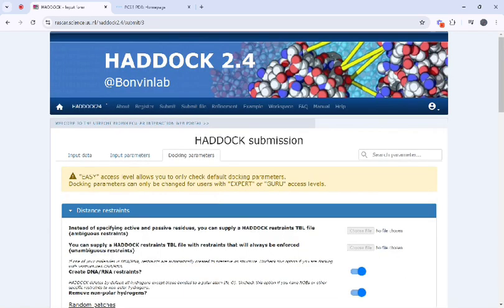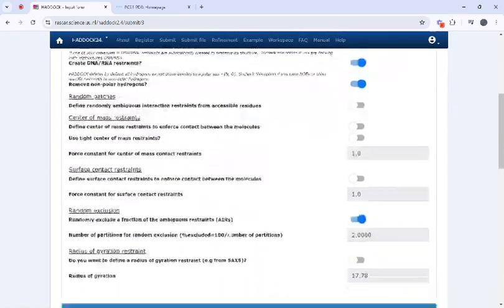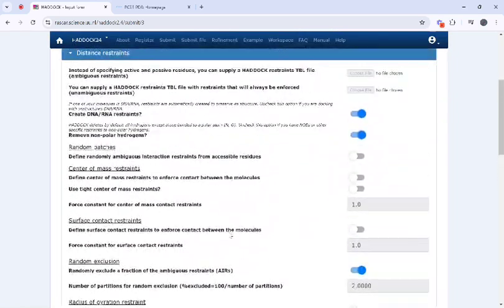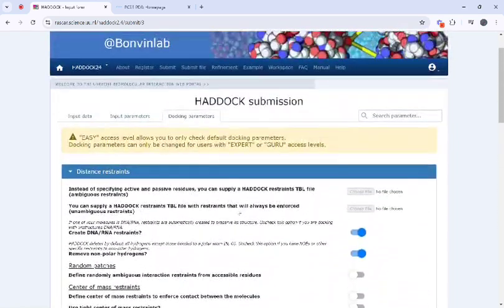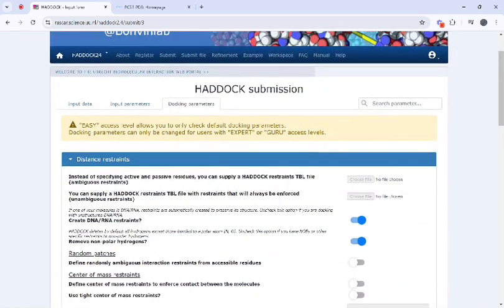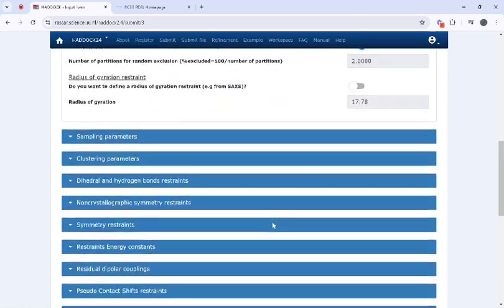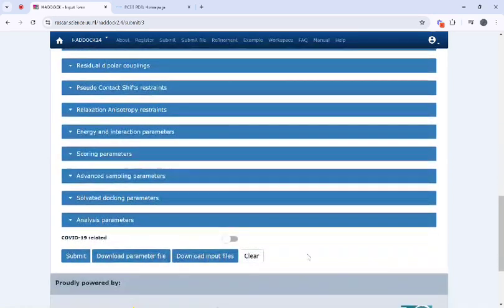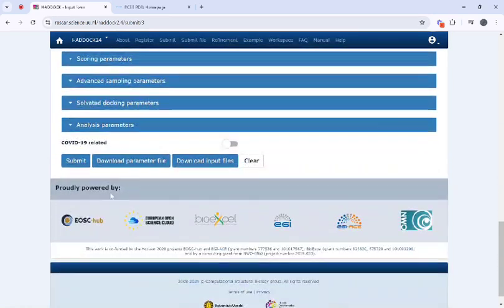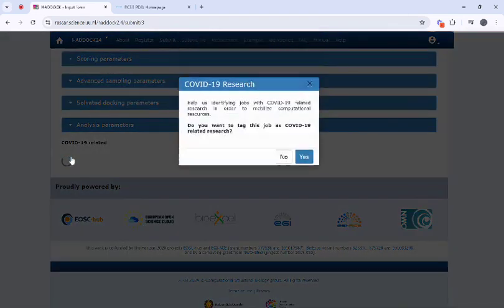Once everything is done, here you can select any parameters but I will just select the default docking parameters. Once everything is done just click on the submit button.